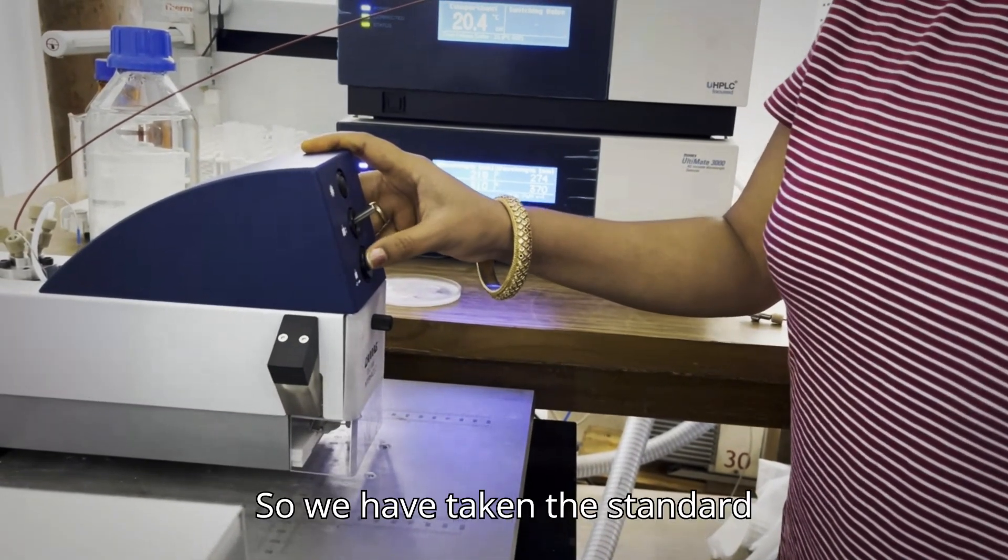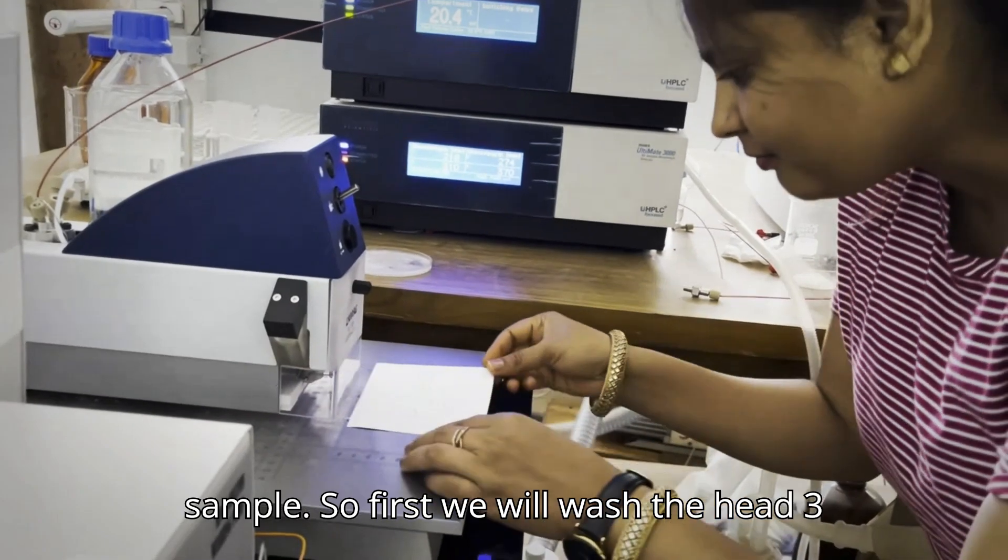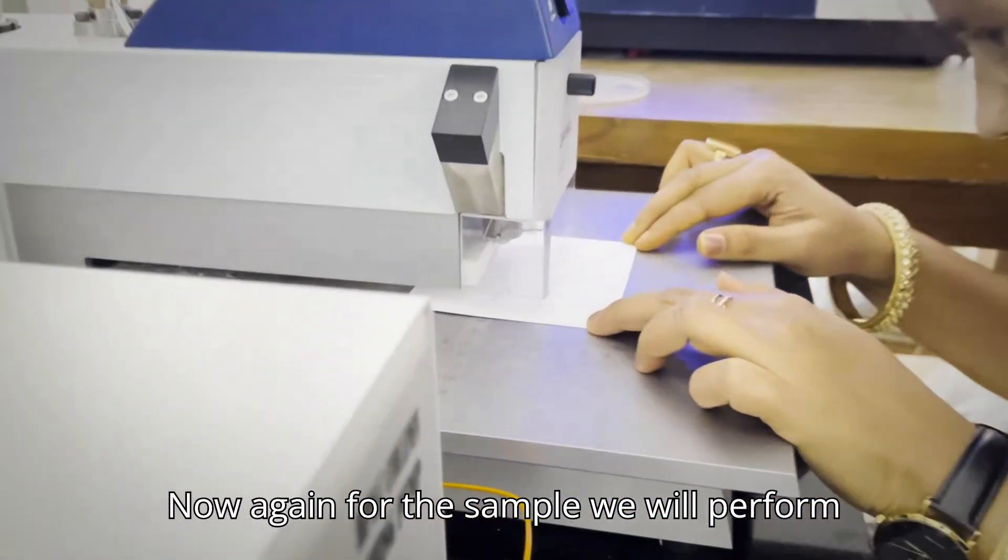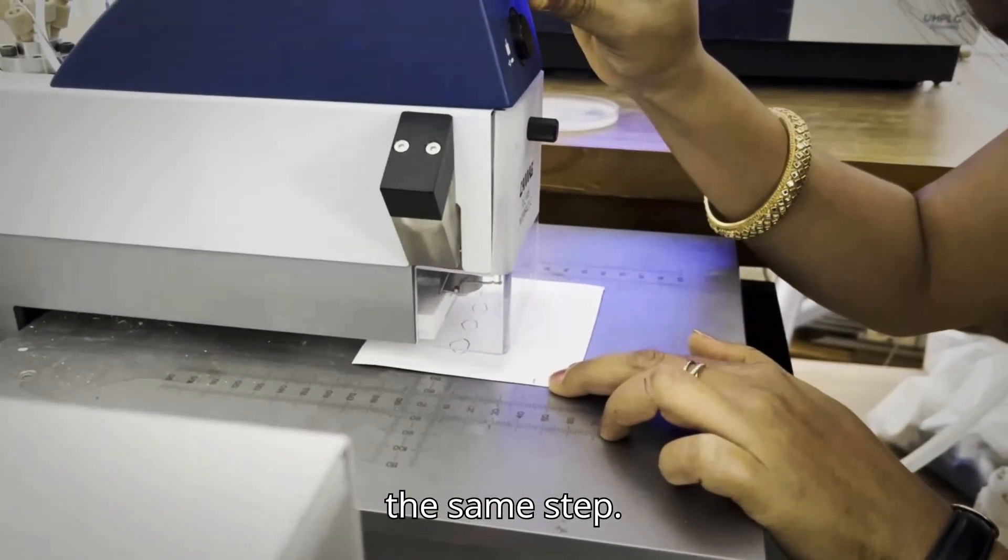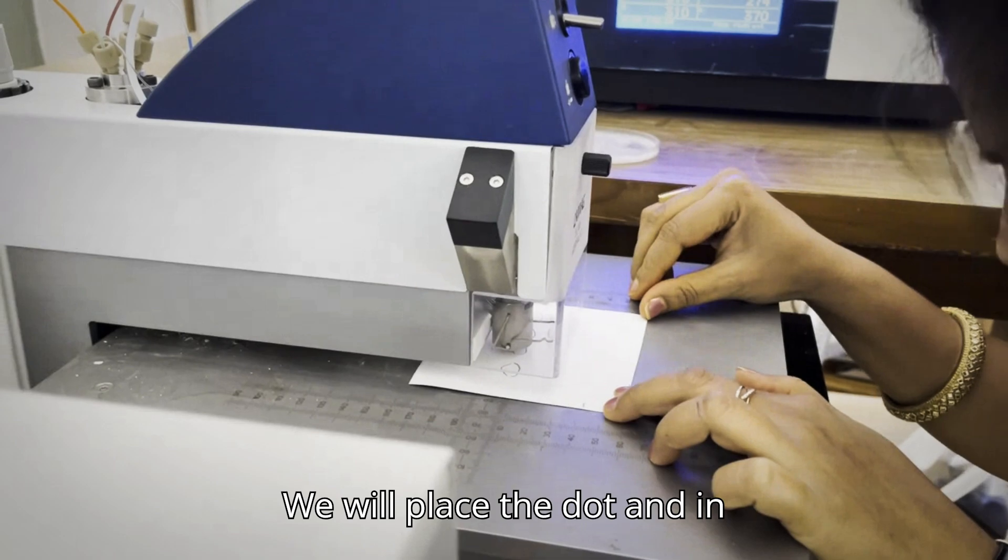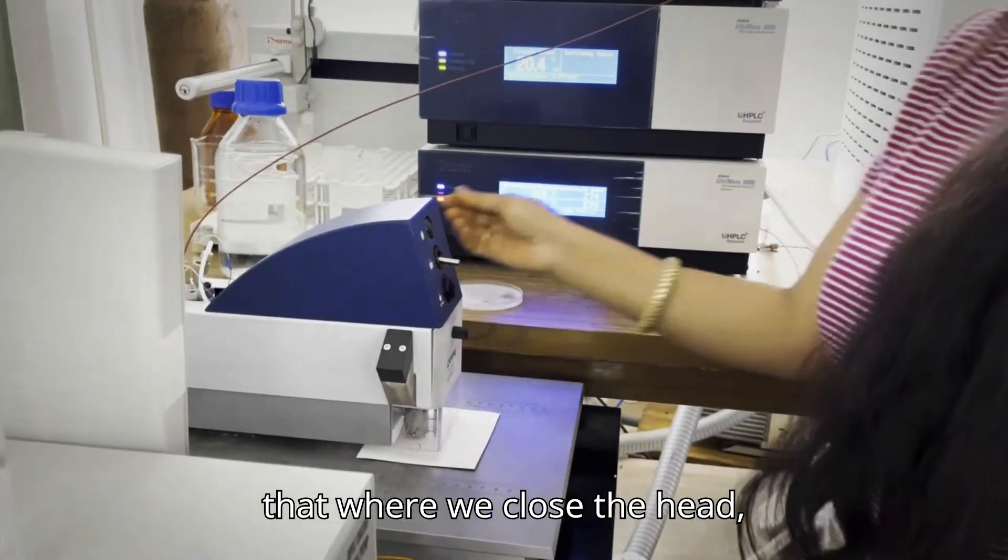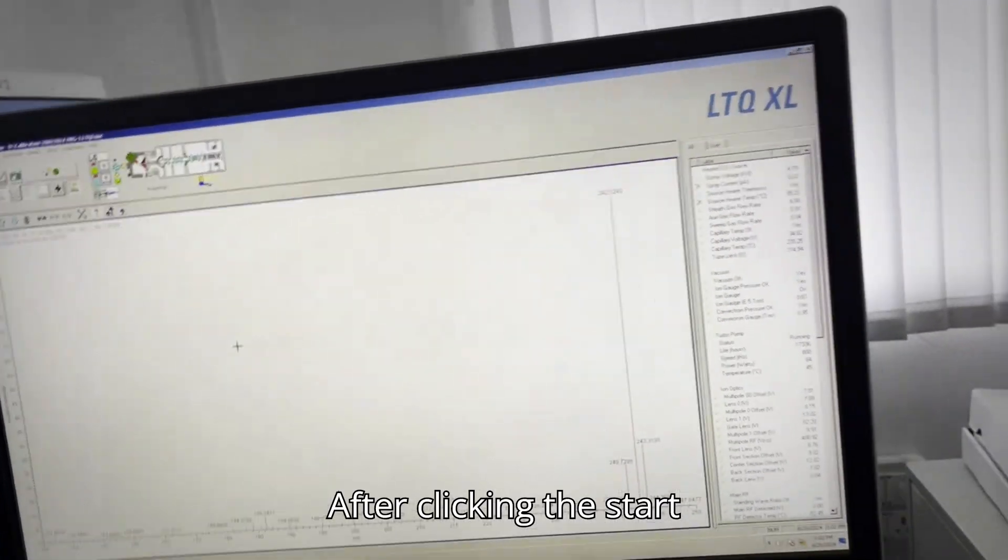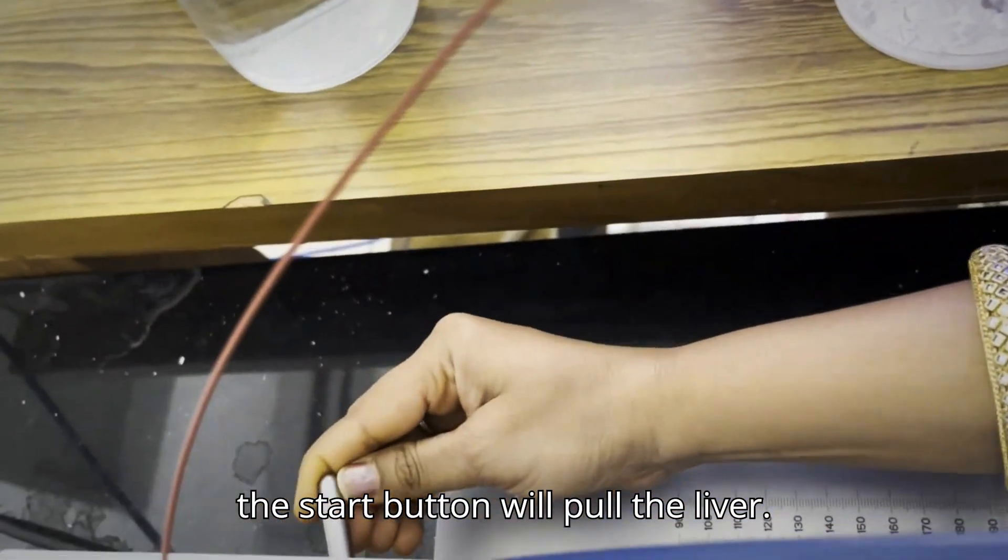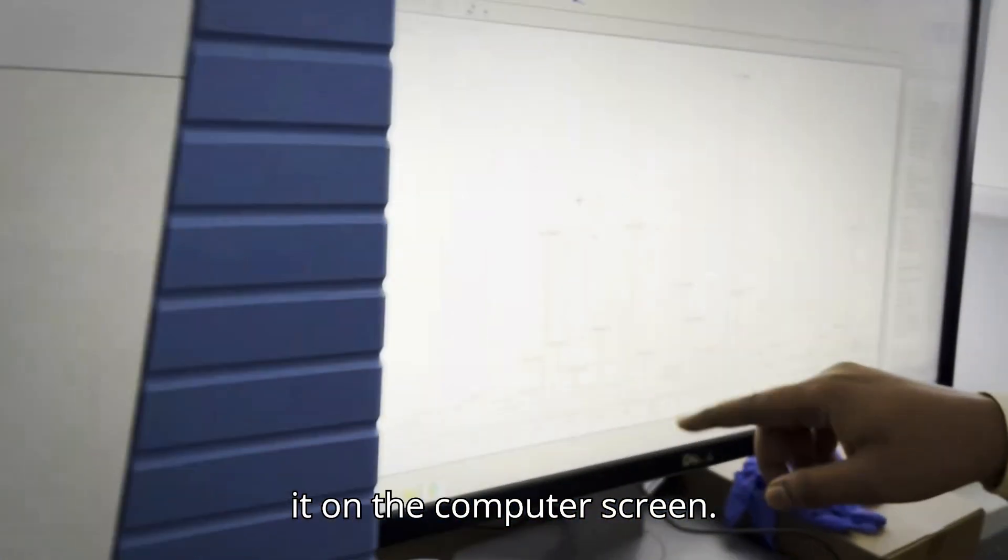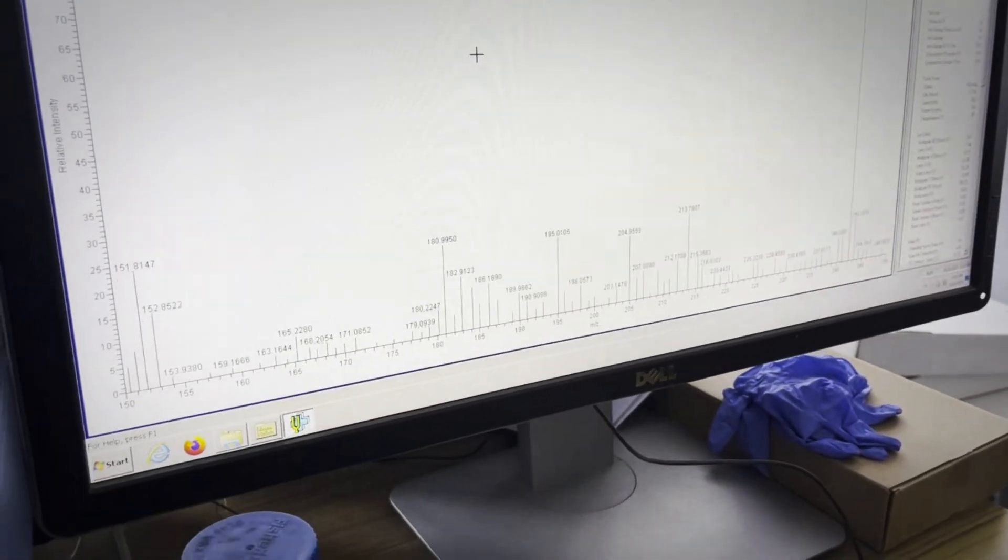We have taken the standard before. Now we are going to take the sample. First we will wash the head three times. Again for the sample, we will perform the same step. We will place the dot and then we close the head. We will click on the start button. After clicking the start button, we will pull the lever. And then you can analyze it on the computer screen, the peak.